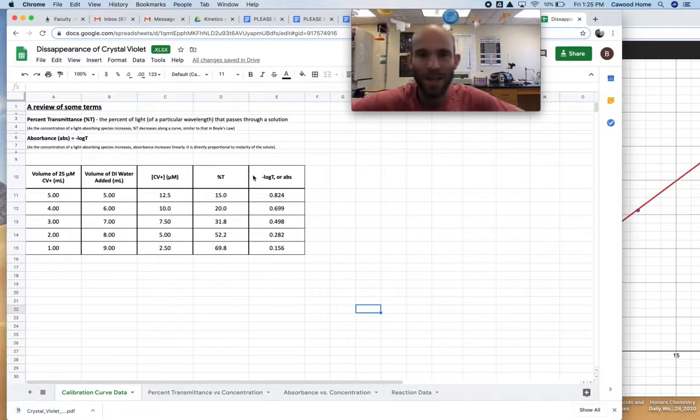So the data just was not going to be very good. So the next time I do this, I gotta use a higher concentration of the sodium hydroxide. It was just so slow. But that does give an indication about the effect that sodium hydroxide has on the rate of this reaction.